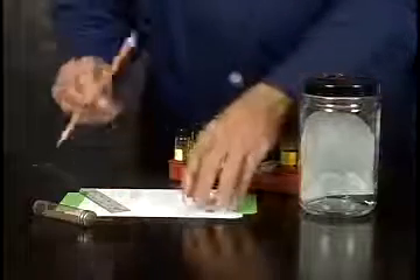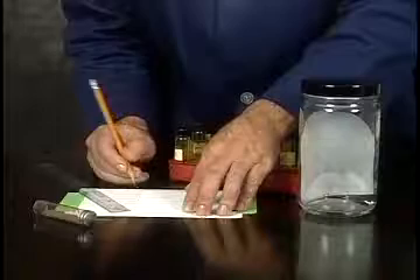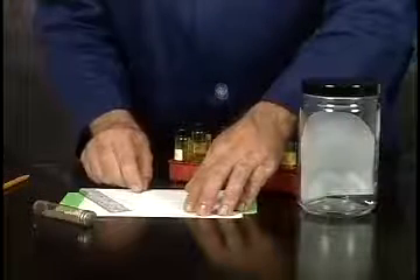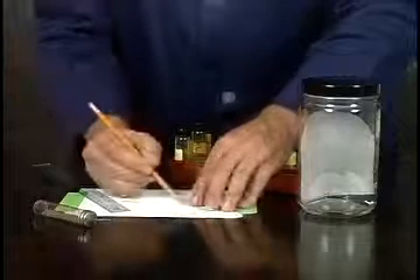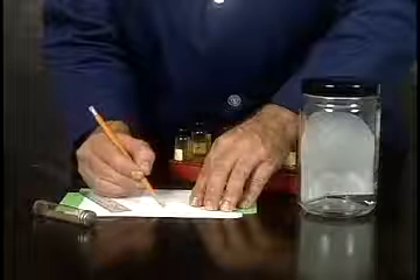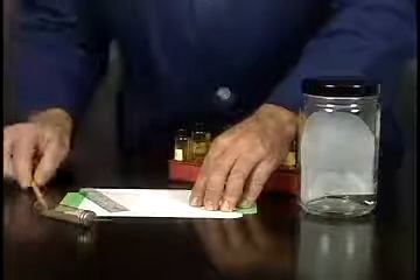Begin by making a mark at the edge of the TLC plate to indicate the origin. Just mark the side and not a line all the way across the plate. At the top, you can indicate what samples you're going to be spotting. We'll do A, B, C, then our unknown, and samples D and E. This is for the DNP experiment.